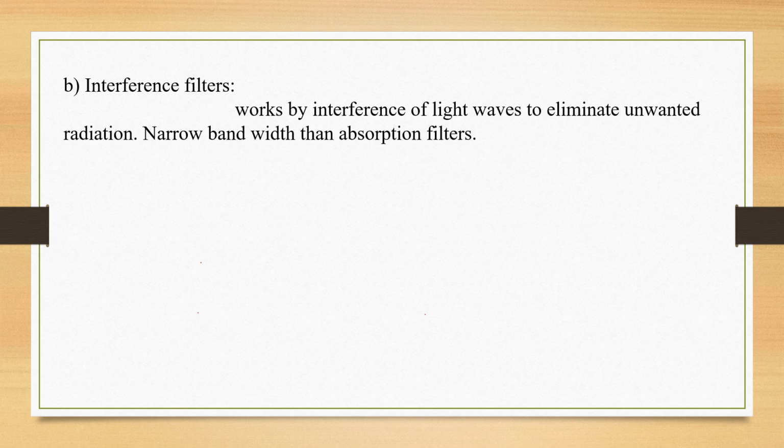Next, interference filters. They work by interference of light waves to eliminate unwanted radiation. They will have narrow bandwidth than absorption filters.